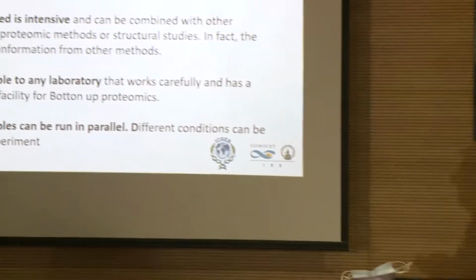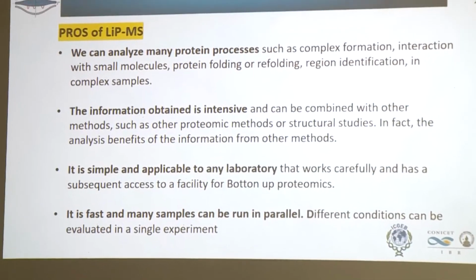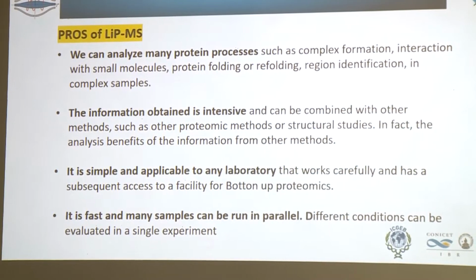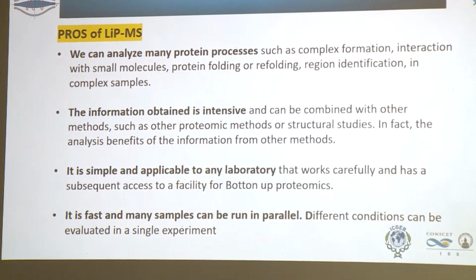The method is simple and applicable because any lab can do it, and the advantage is that it's fast enough that you can run several samples in parallel.